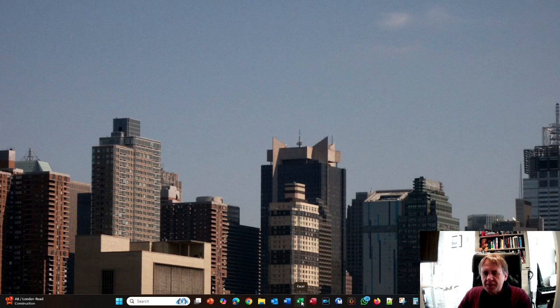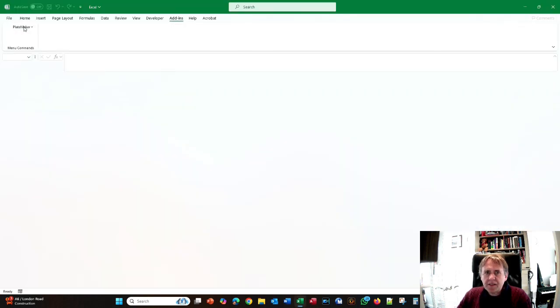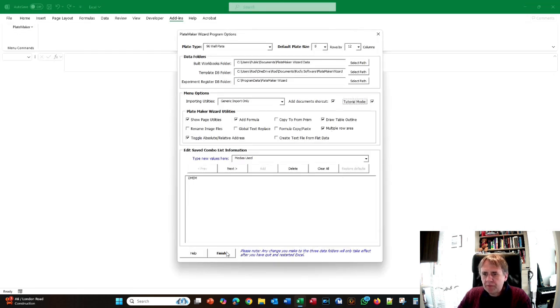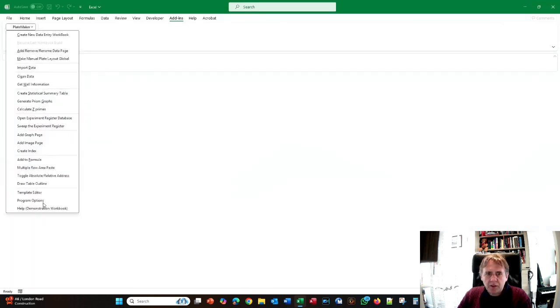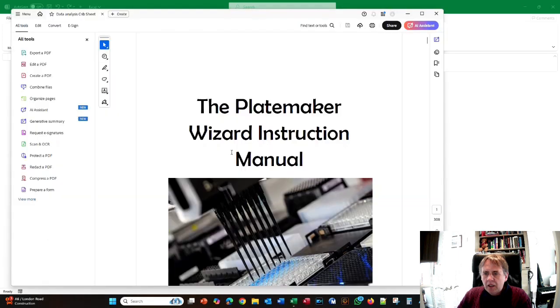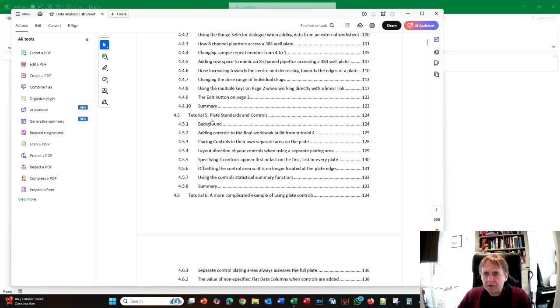So we know the drill. Let's start Excel and we go into add-ins. We're going to put the program into tutorial mode. We're then going to go to the help menu. We're going to view the instruction manual, and then we're going to go down and select tutorial 5.